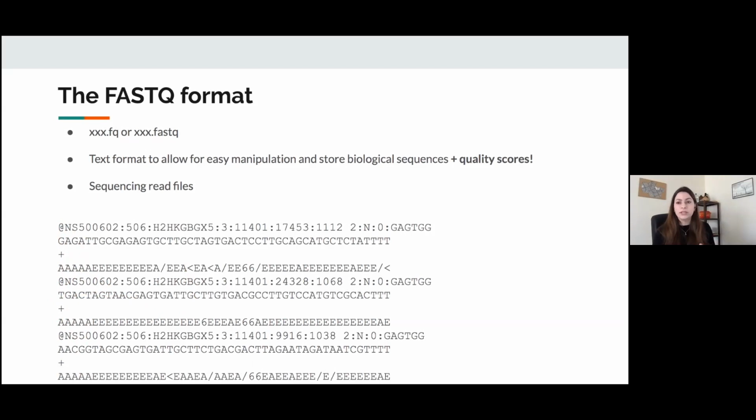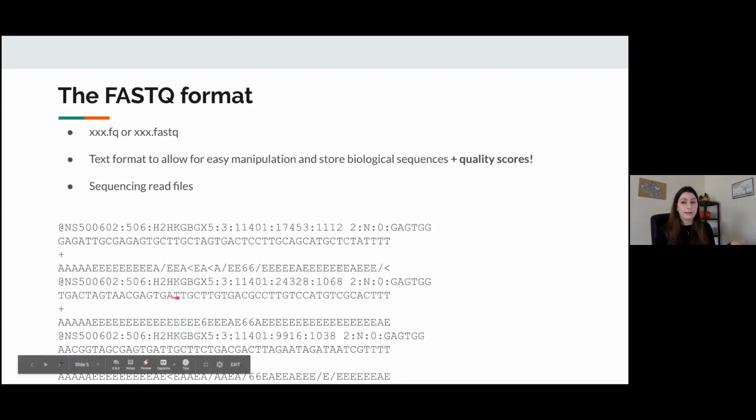It's what you will usually find, but in theory, if you remember the Fasta file, the sequence information could span multiple lines, and that same thing can happen in a Fastq file. But it makes life harder to have it like that, and most of the sequencing information we work with now are very short reads, so we can contain them in 1 line. So that's how you will usually encounter it.